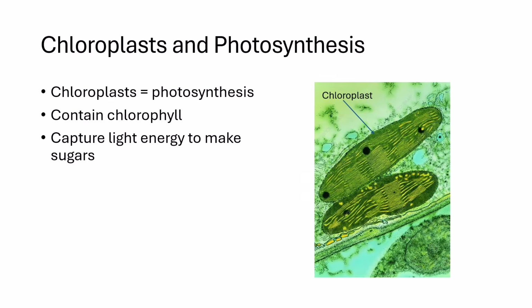Chloroplasts are specialized organelles responsible for photosynthesis. They contain chlorophyll, the green pigment that captures light energy. In Elodea cells, chloroplasts are often visible as small green bodies moving around the edges of the cell. As you observe, think about how their position in the cell supports their function.